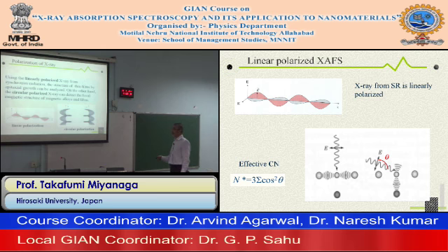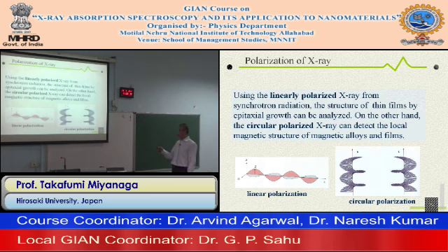Next polarization is the circular polarization. In case of some facilities, we change from the linear polarization to the circular polarization. This circular polarization is very useful for the analysis of magnetic systems, the spin and orbital magnetization systems. We discuss next the applications to magnetic systems using the circular polarization.